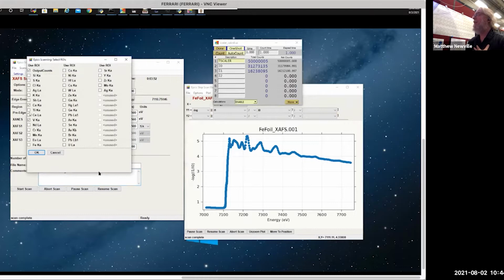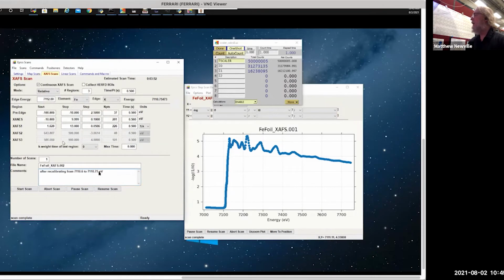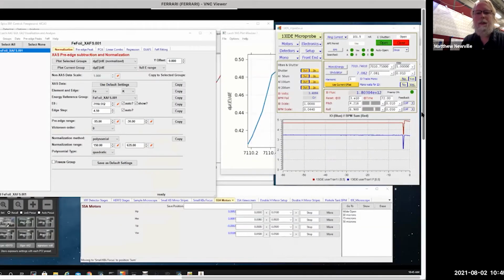We had been doing calcium and vanadium. I'm just going to select that we'll also collect the iron K alpha fluorescence so that we get that in this spectrum as well. With that, I'm just going to show you that the iron, I'm just going to hit start on this, but the iron fluorescence is totally unusable for fluorescence analysis. So that's going to start. I'm going to go back to sharing now this screen.